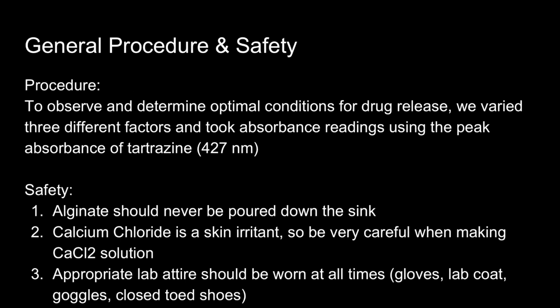The general procedure of this lab was to observe and determine optimal conditions for drug release. In order to do this, we varied 3 different factors and took absorbance readings using the peak absorbance of tartrazine, which was 427 nanometers. A couple of safety precautions that we had to take were to not pour alginate down the sink and to wear appropriate lab attire because calcium chloride is a skin irritant.